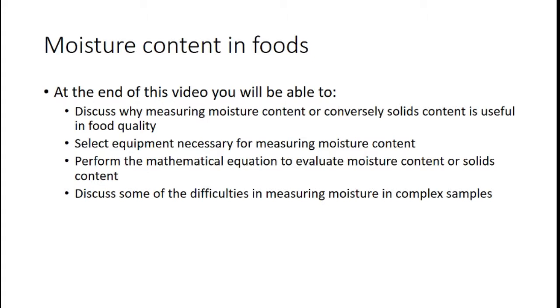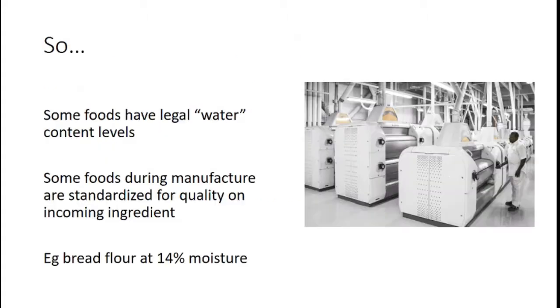So in this video, we're going to discuss why measuring moisture content or solids content is useful. We'll discuss the equipment necessary for doing it. We'll go ahead and do some of the math to evaluate the moisture content or solids content of products, and then we'll talk a little bit about some additional logistics and difficulties for measuring moisture in complex samples and troubleshoot some opportunities to overcome those challenges.